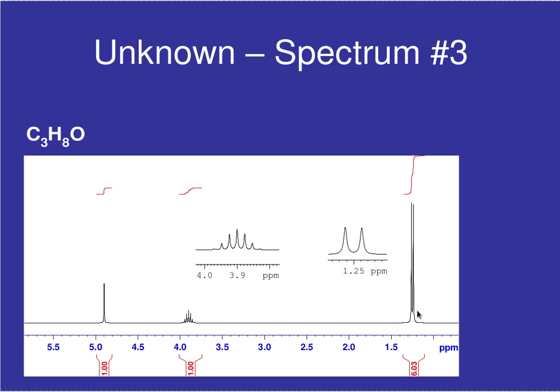Of course, the third thing can't be carbon attached to anything, or else you end up with too many carbons. You've got 2 carbons from the 2 CH3s. You've got a carbon from a CH. So the remaining signal must be an OH. And it's interesting that if you look at chemical shifts, signals around 4 are normally CHs or CH2s or CH3s that are in close proximity to an oxygen. So this here, because it's integrating to 1, must be a CH that's attached to an oxygen.